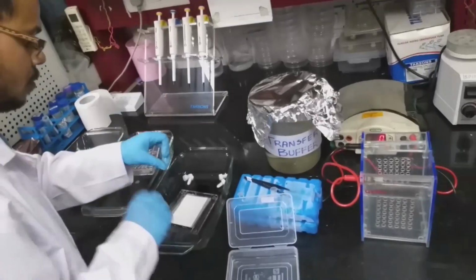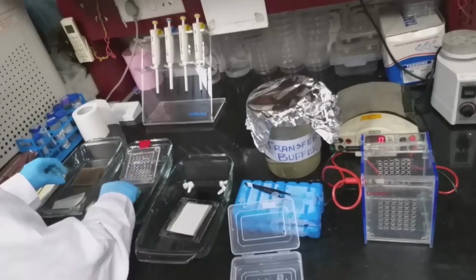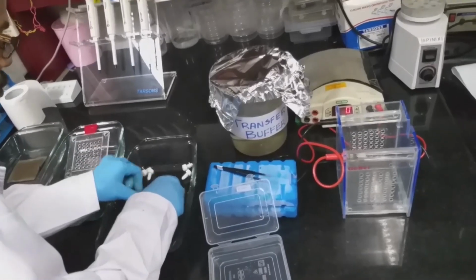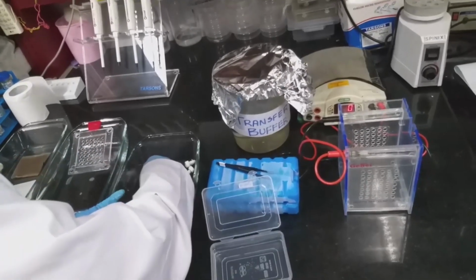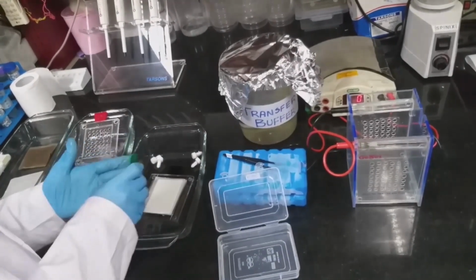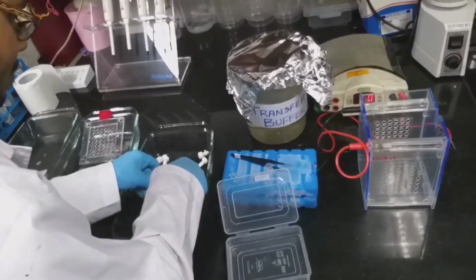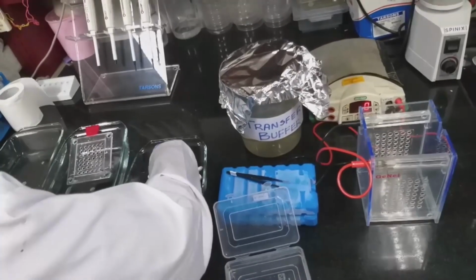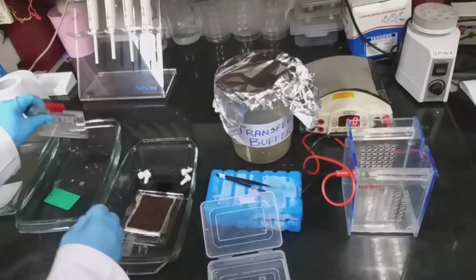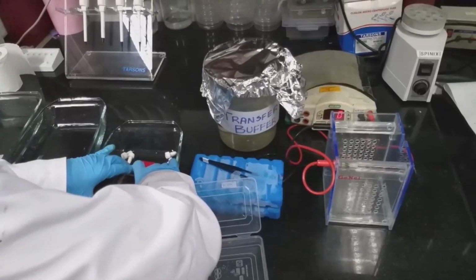Next we have to remove any air bubbles if present. We have to overlay with another blotting sheet and remove the air bubbles. Each and every time you introduce something, you have to remove air bubbles. So this is the final sheet. This is the positive side of the cassette. Just keep it like this.